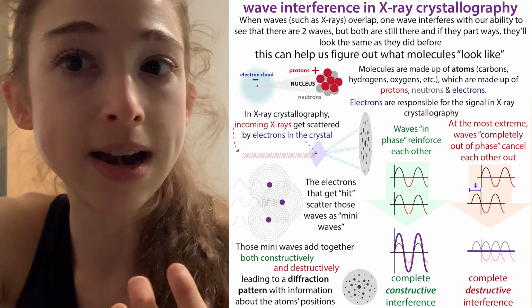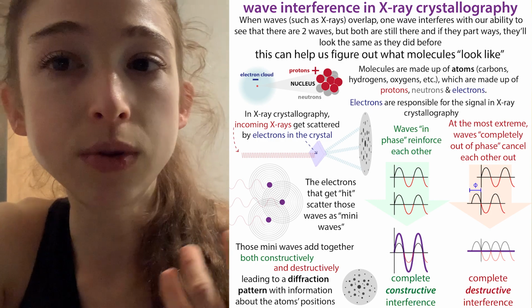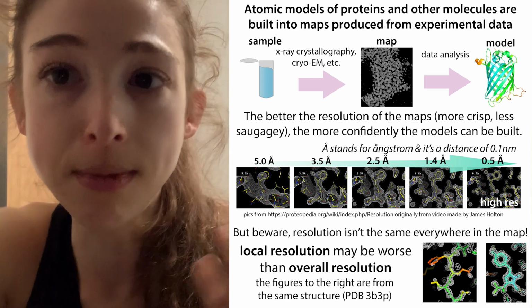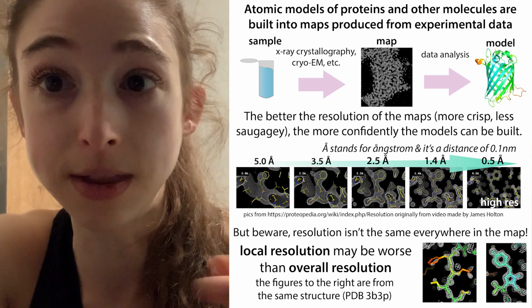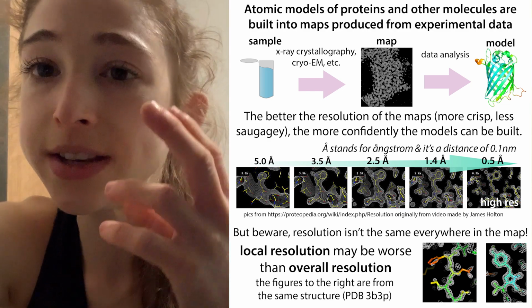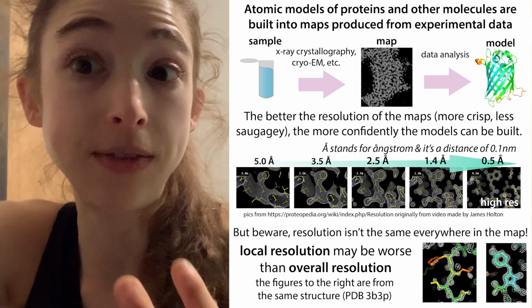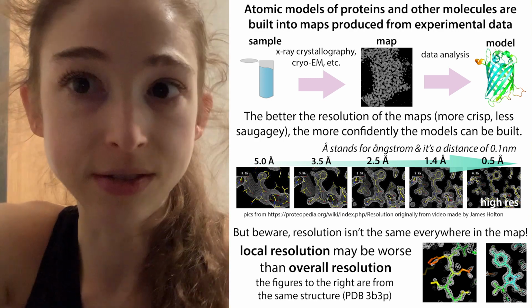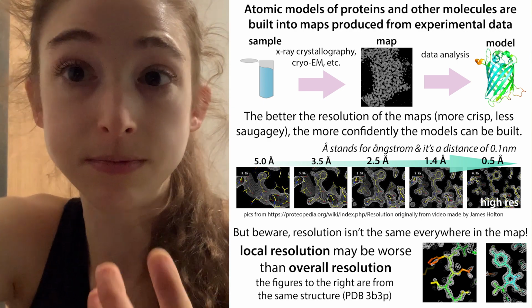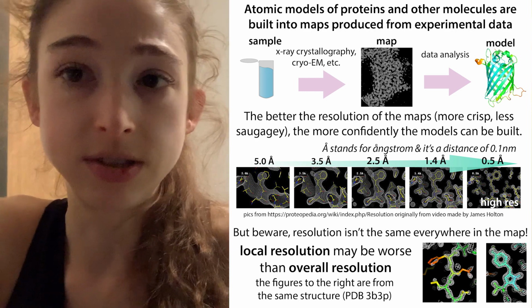So what you have to do is say, okay, well, if the structure was like this, what would the phasing be like, and does this match? And so with crystallography, your map is actually going to change as you build that model in, because you're going to improve your model, which is going to improve the map, hopefully, and then back and forth and back and forth. Because you're basically trying to figure out what the map should look like if your model is right. And if it's not right, then the map will look worse, and then you change it. But the bottom line is you have to actually have some modeling built in when you're making that map. So yeah, it can get really confusing with crystallography maps.